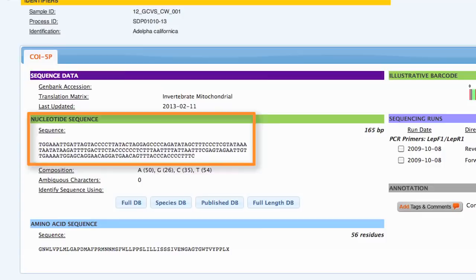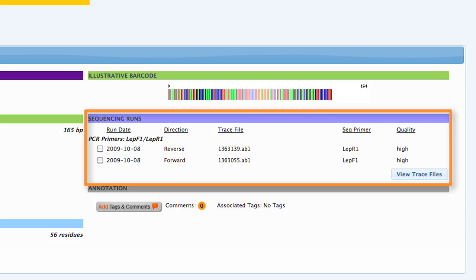The sequence page displays the nucleotide sequence, the amino acid sequence, the illustrative barcode, and the trace file information for the specimen.